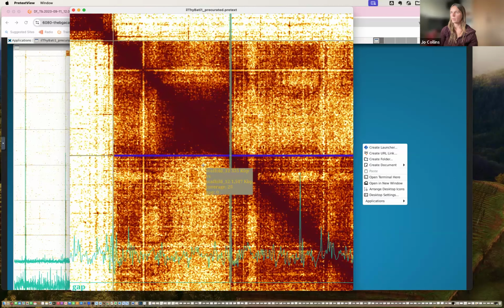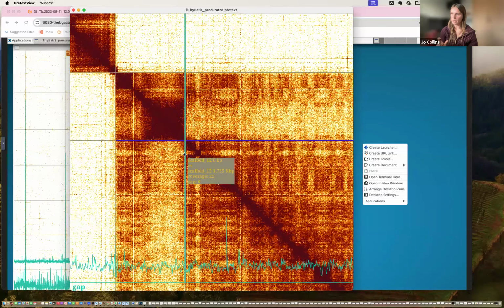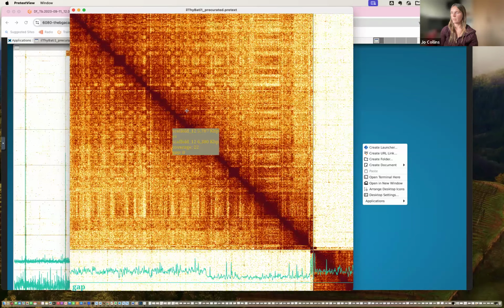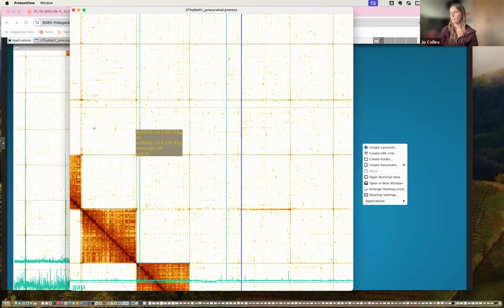And now if we take a look at what we've now got, telomere sequences lighting each other up, and we have affinity through the region which previous to this had lost affinity at this point. So we can be fairly confident that we've made a change and the change has now corrected the assembly over that region. So we'll go back through the rest of the chromosome, which all seems to look okay.